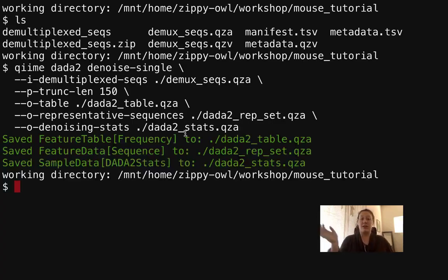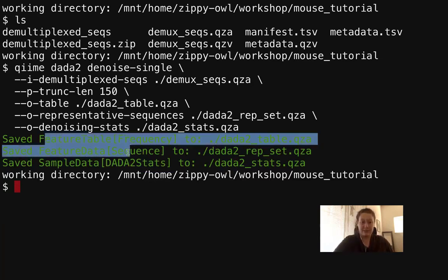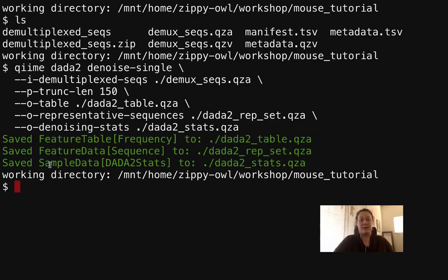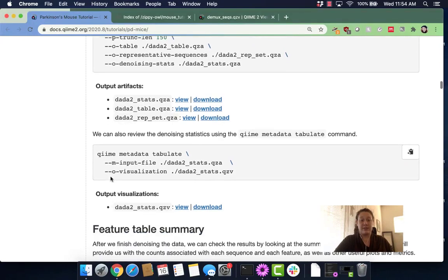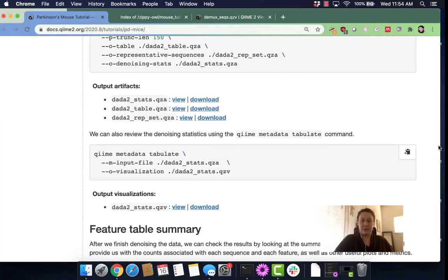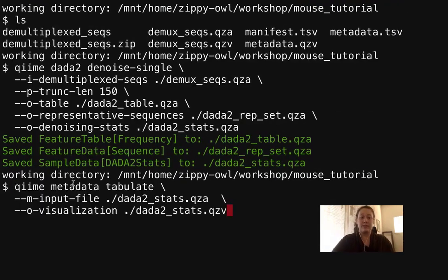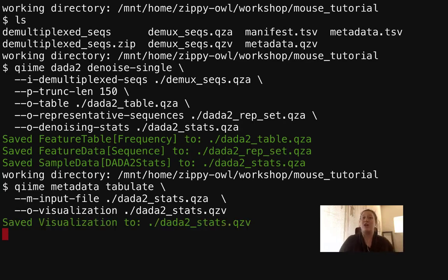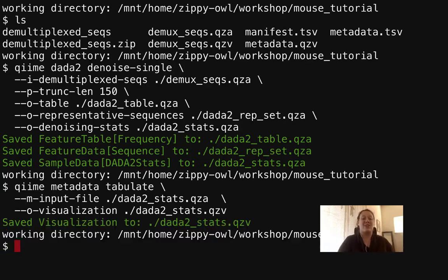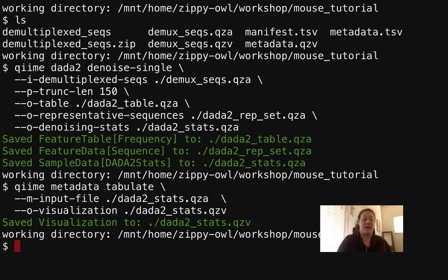So we just got all of the outputs that I talked about. You can see that these are feature tables and this is sample data. The next step we're going to do is we are going to run metadata tabulate. We are going to run this and then we'll get a visualization of that stats.qza file. It didn't take very long and now we have that stats.qzv file.